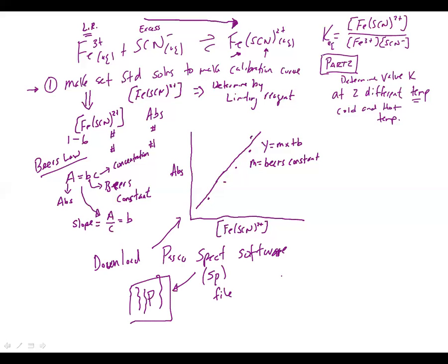You will need to calculate the concentration for each of the absorbances. So you have a couple options as to how to make the graph. You could either use the software that we used for the first one, or I believe there's a file that you can use for Excel as well.